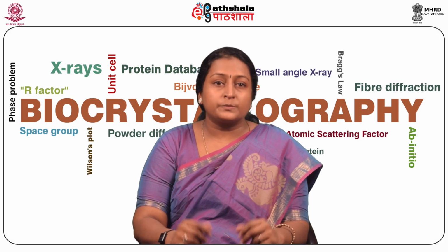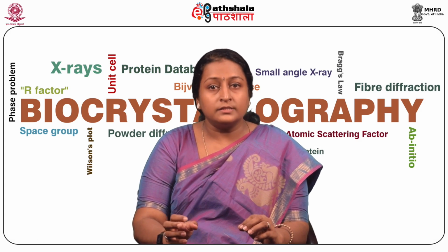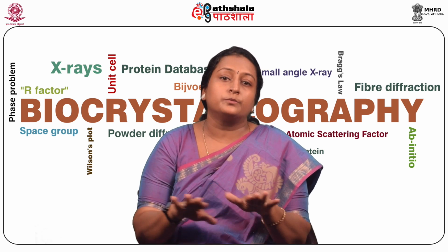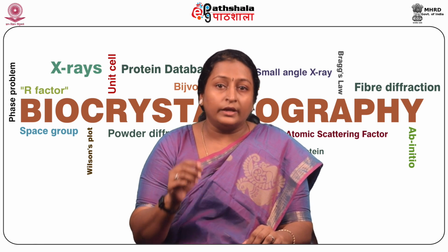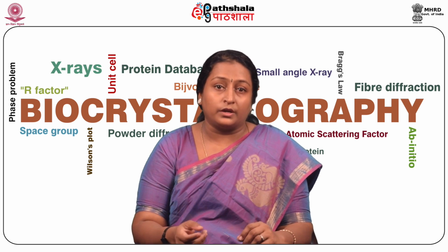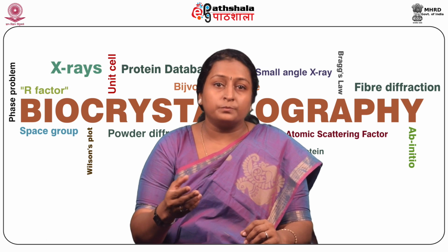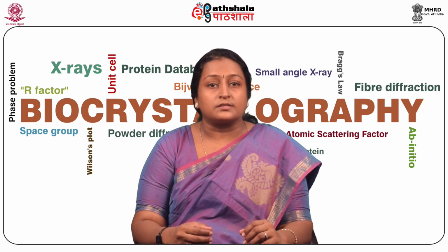For preparing a powder specimen, we need an ideal powder sample that should have many crystallites in random orientation. The distribution of orientations should be smooth and equally distributed among all orientations. If the crystallites in a sample are very large, there will not be a smooth distribution of crystal orientations, so one will not get a powder averaged diffraction pattern. Crystallites should be less than 10 micrometers in size to get good powder statistics.